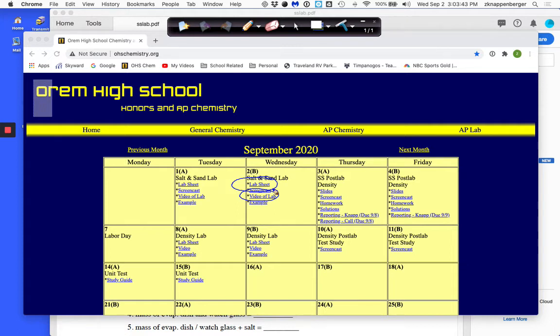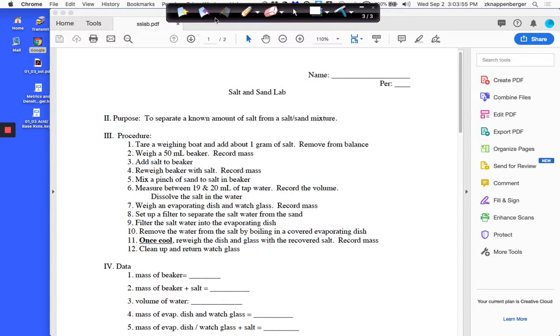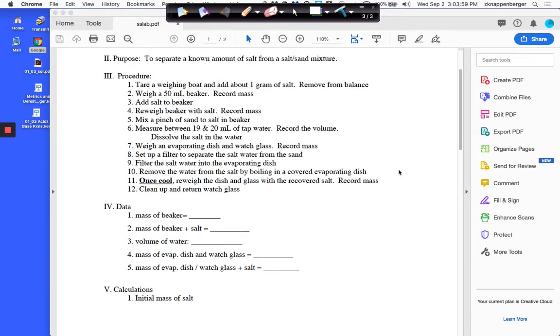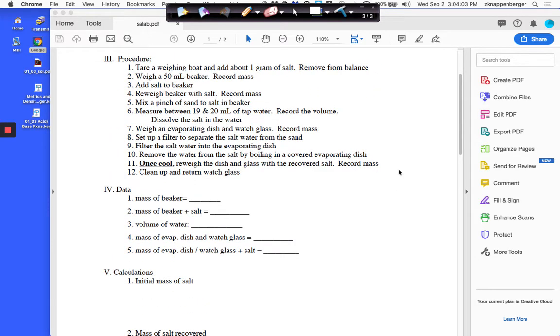After having done this, the question then becomes, how do you analyze the data that you've collected? And that's what I would like to take a second and explain to you how to do. So in order to do that, I will actually make up a little bit of data just to give you a sense of how this goes. This will make more sense after you watch the video of the lab and get a sense of what we're actually doing. But once you're there, it'll be time for you to analyze your data, and I'd like to show you how to do this.